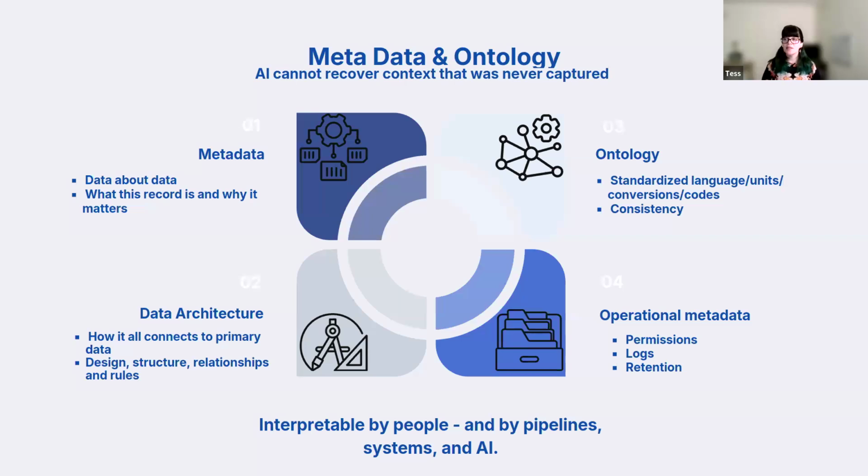It helps with consistency and ensures that everybody in the lab has the same level of alignment and understanding of how different words are used within the different teams and projects. Metadata is also a part of this, so we have to ensure that everyone's collecting the same metadata, understanding why that metadata is important to collect, and is naming those fields the same way.